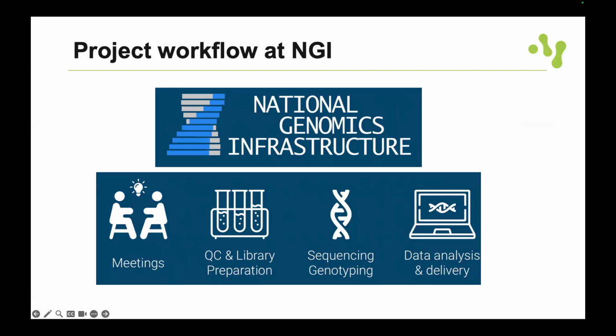I'm currently evaluating the last iteration of their kit, the service of Parse that's being offered. So most of the service has been transferred. It's offered in Stockholm, but with Parse you fix the cells. So you ship the cells to Stockholm instead, and they will help you process it. So we're really happy to discuss. But if needed to have live cells, we have the possibility also to run in Uppsala. And actually, maybe the next slide is kind of going there.